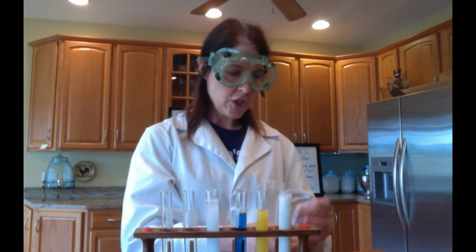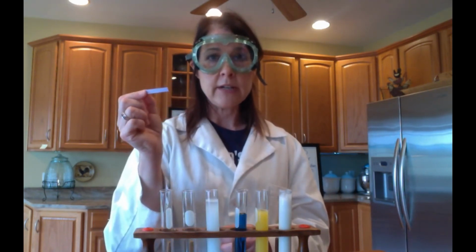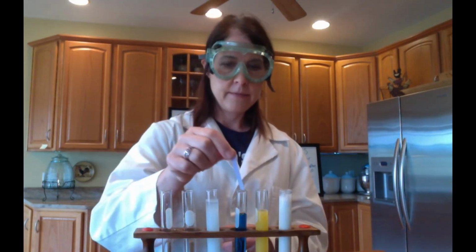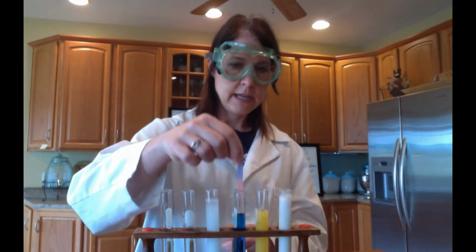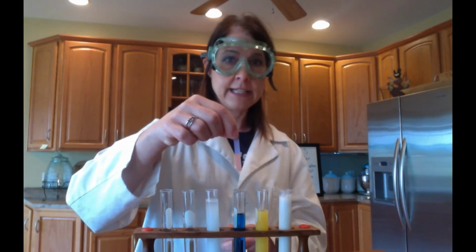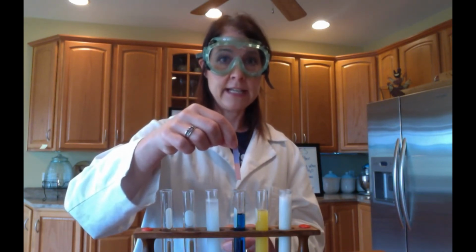I'm going to take a sheet of blue litmus paper. If toilet bowl cleaner is an acid, it will turn this blue litmus paper red. I'm going to go ahead and dip that in and pull that out, and we can see that it is definitely red, which means this toilet bowl cleaner is indeed an acid.